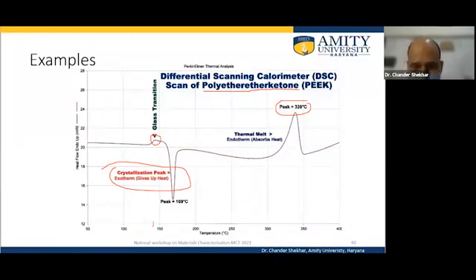No, we can have isothermal breaks as and when needed. That method we will describe in the demonstration in the afternoon. We can program as desired; we can increase or decrease, basically change at a desired rate. We can have a seesaw kind of heating rate as well. Pulse heating is not possible in this particular software. We need to upgrade the software for that.